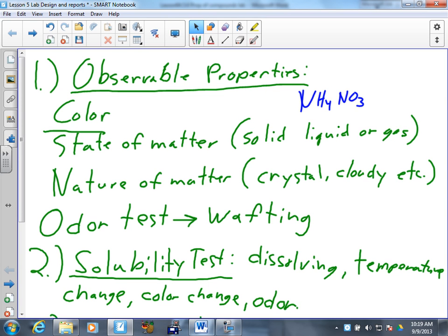So make sure that you are looking just at the liquids. The liquids that do have an odor are very characteristic, and they will be very useful in identifying what the compound is, along with, of course, the conductivity test and all of that. You'll want to make a note of this as well because it's really important.